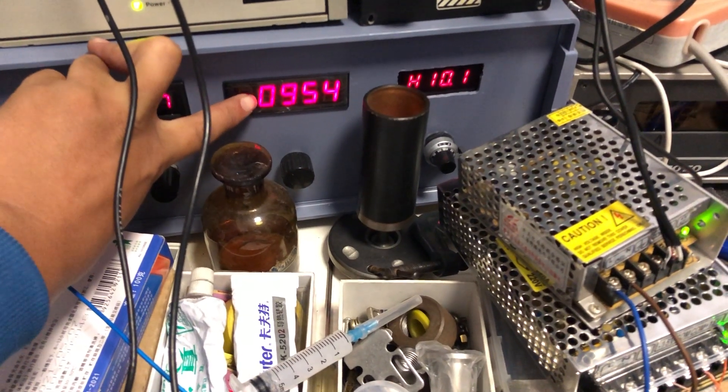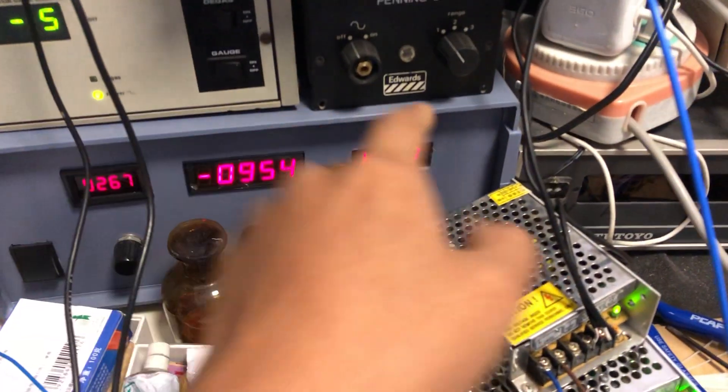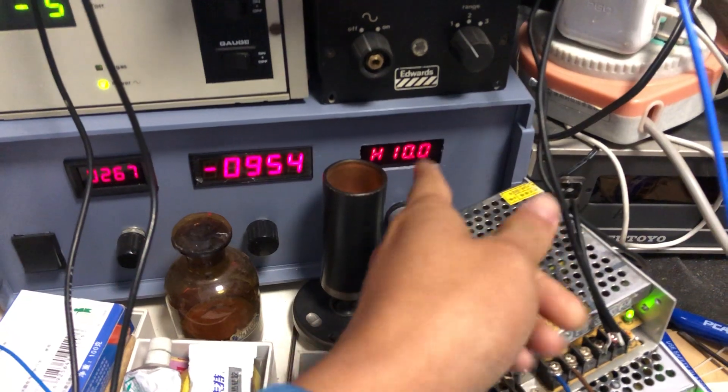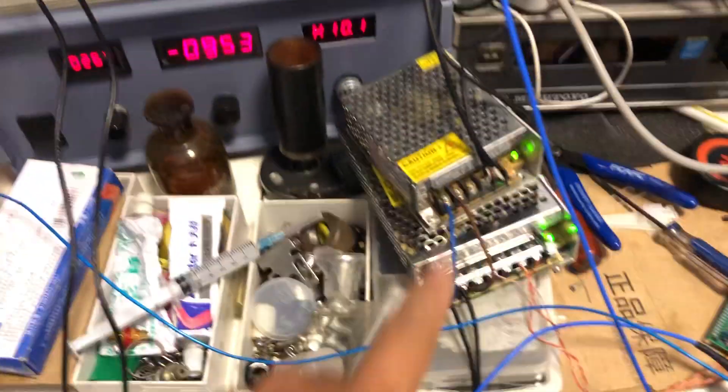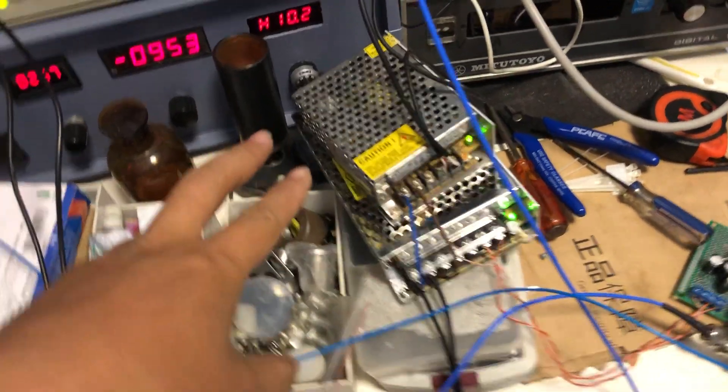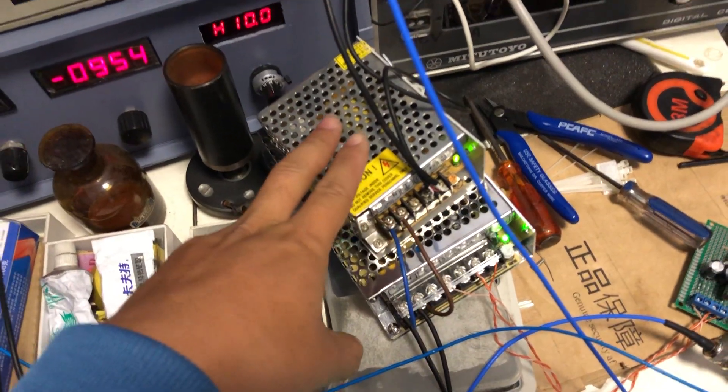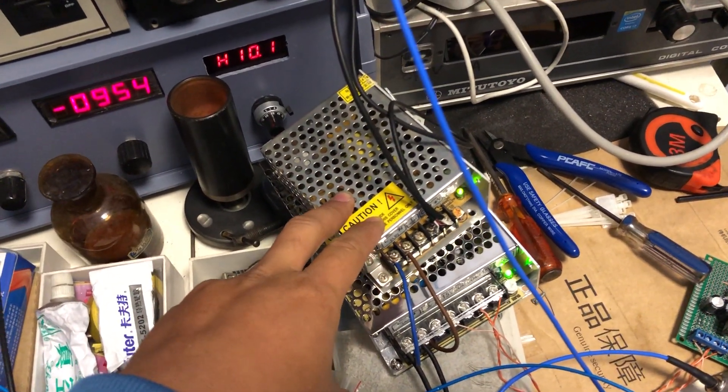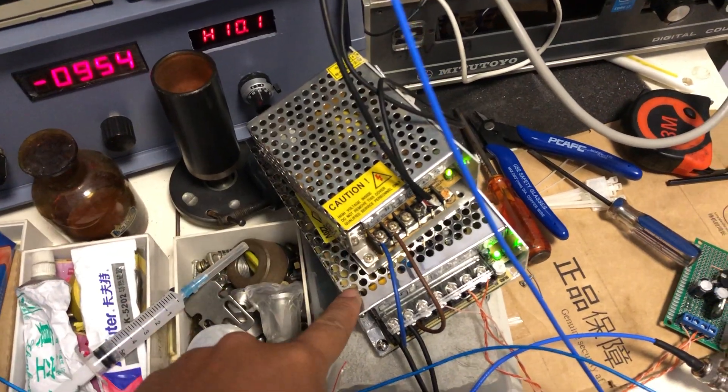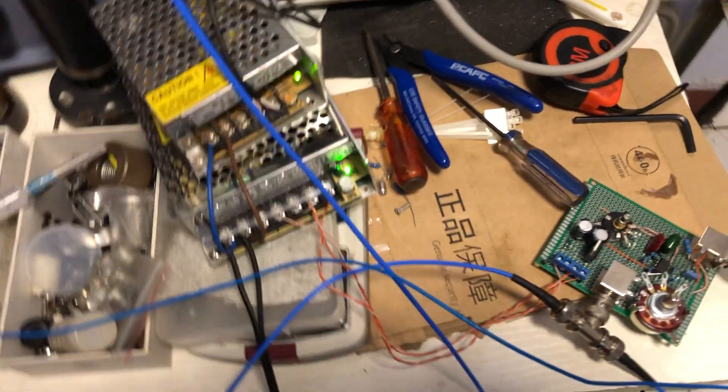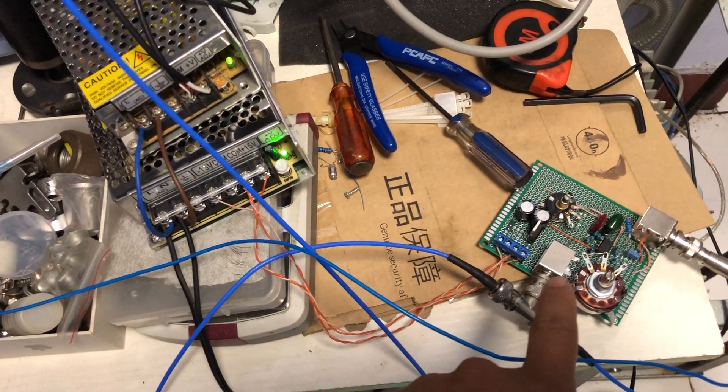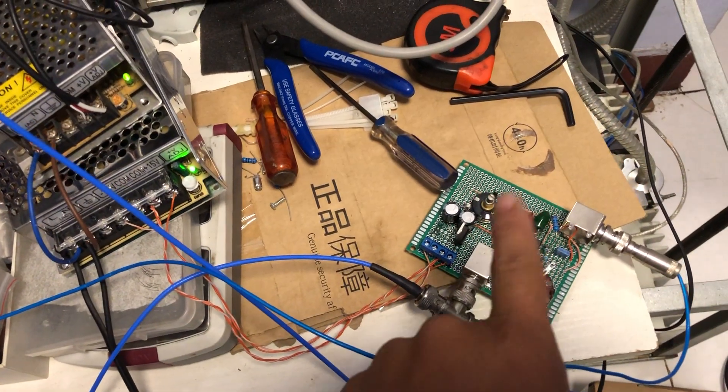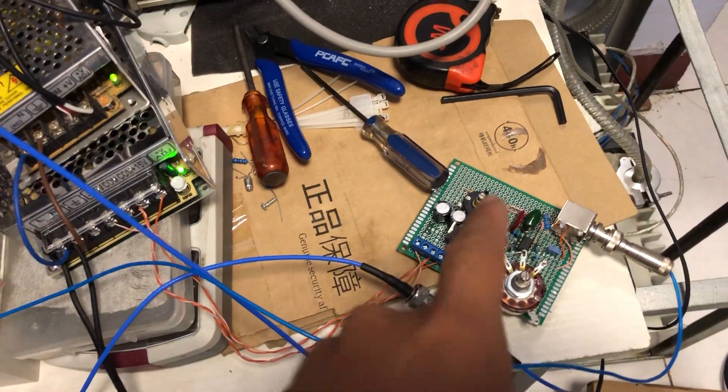And here is the power supply for the scanning signal generator. Here is the power supply for the photomultiplier output and the amplifier and the offset control.